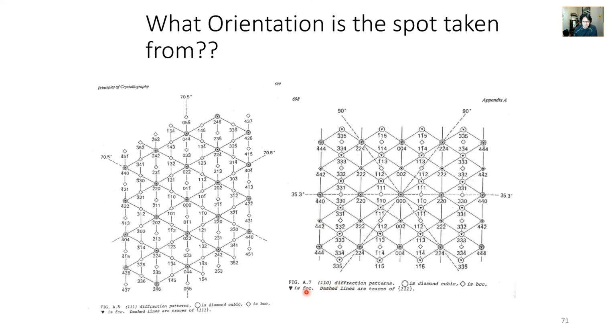But yeah, I was taken aback by this error. Zone axis is a direction, folks, so this should be like a bracket, a hard bracket, and not the parentheses. But anyway, you see tables like this in different books and articles and stuff like that. And so there's kind of these published arrays. There's, again, computer software, and I'll be honest, I'm not that familiar with crystallography computer software.